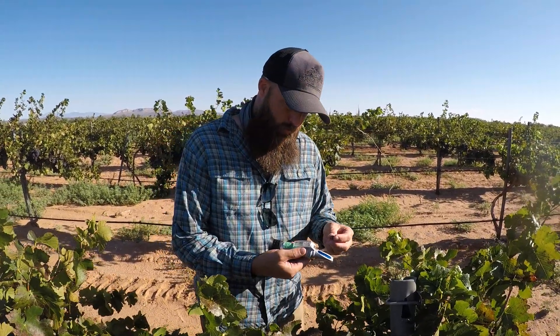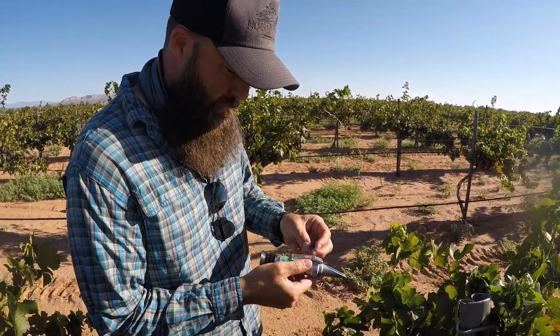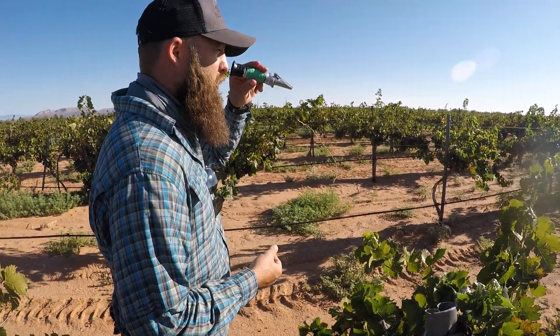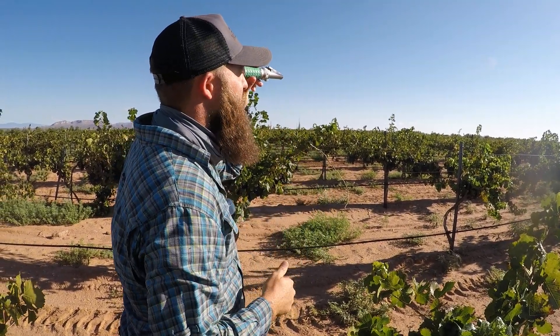So what you're going to do — this is a refractometer, which is a sugar scope basically. We're going to come in here. I'm going to make sure I load this thing up with a good chunk of the juice coming out of the berry. And if you look through here, it's going to be numbered, and the higher it goes, of course, the higher the sugar content.